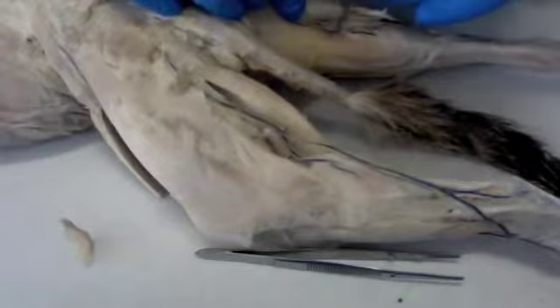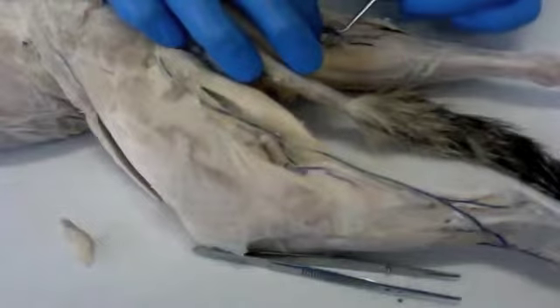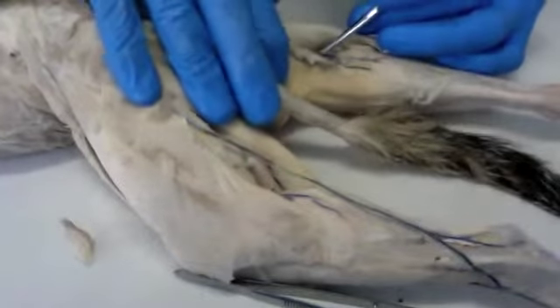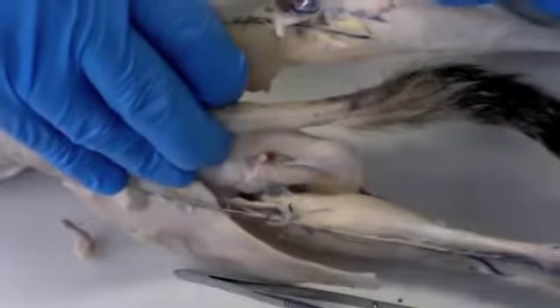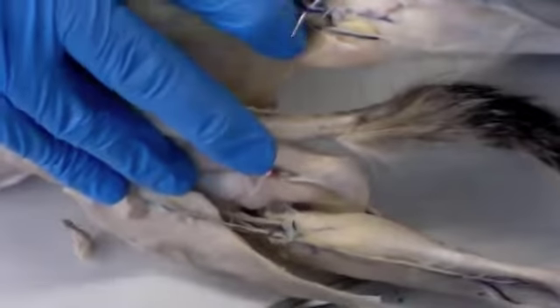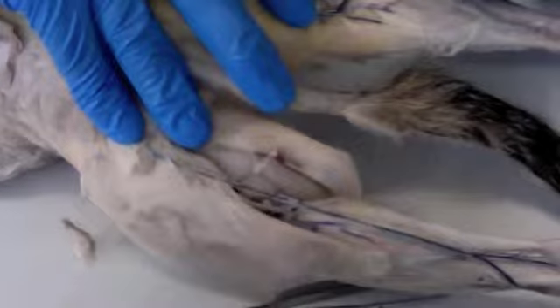So the popliteal artery is right here. It's pretty deep in there. And that was a tendon stuck right there. It's located right here. There you go. There's the red.